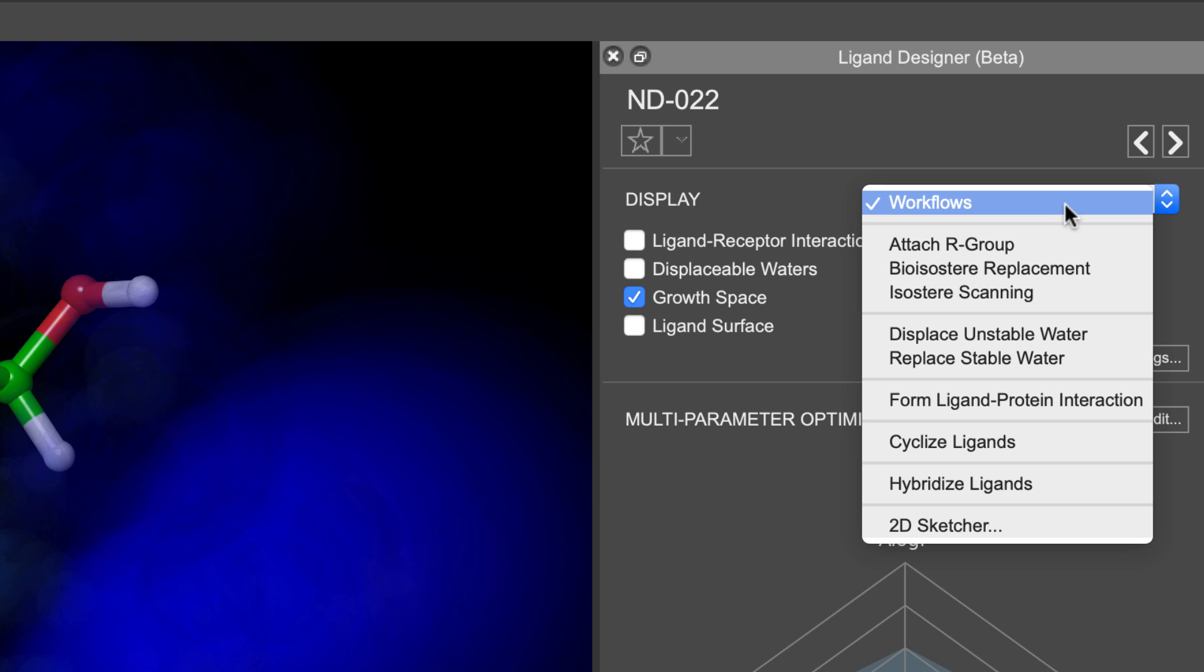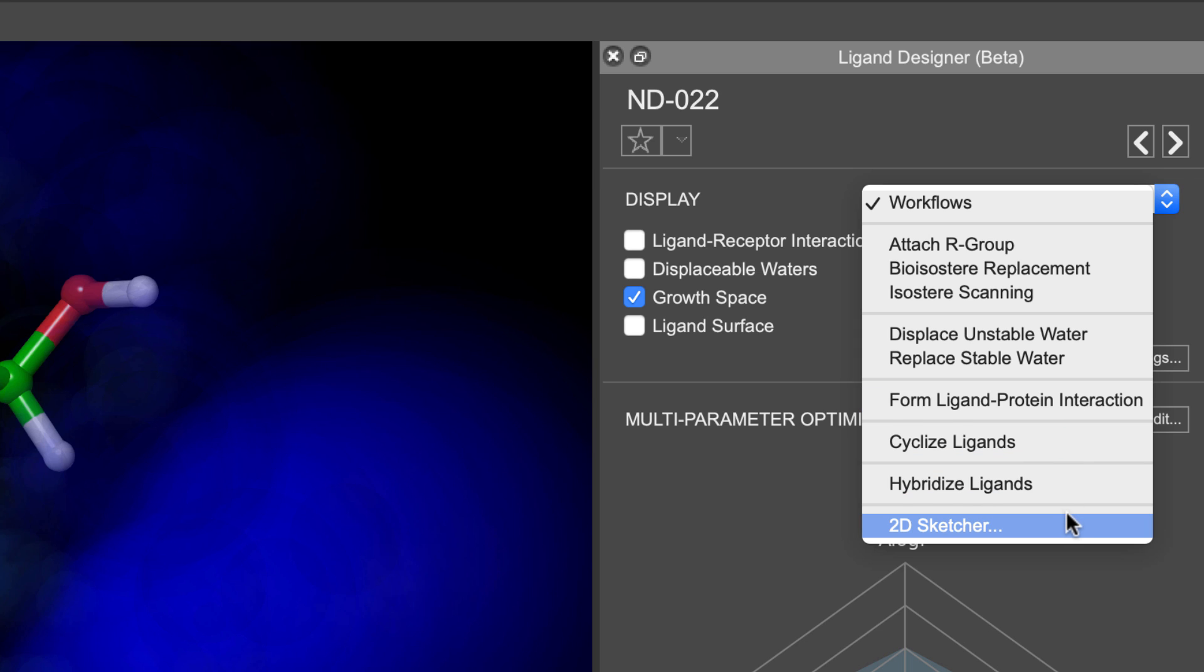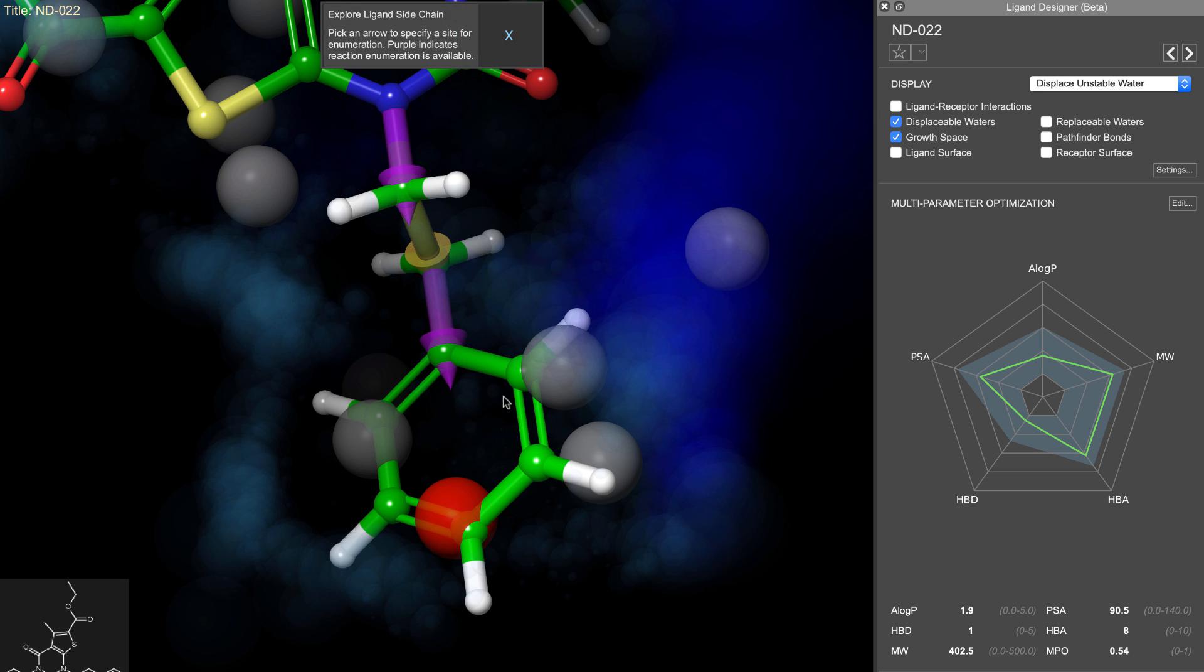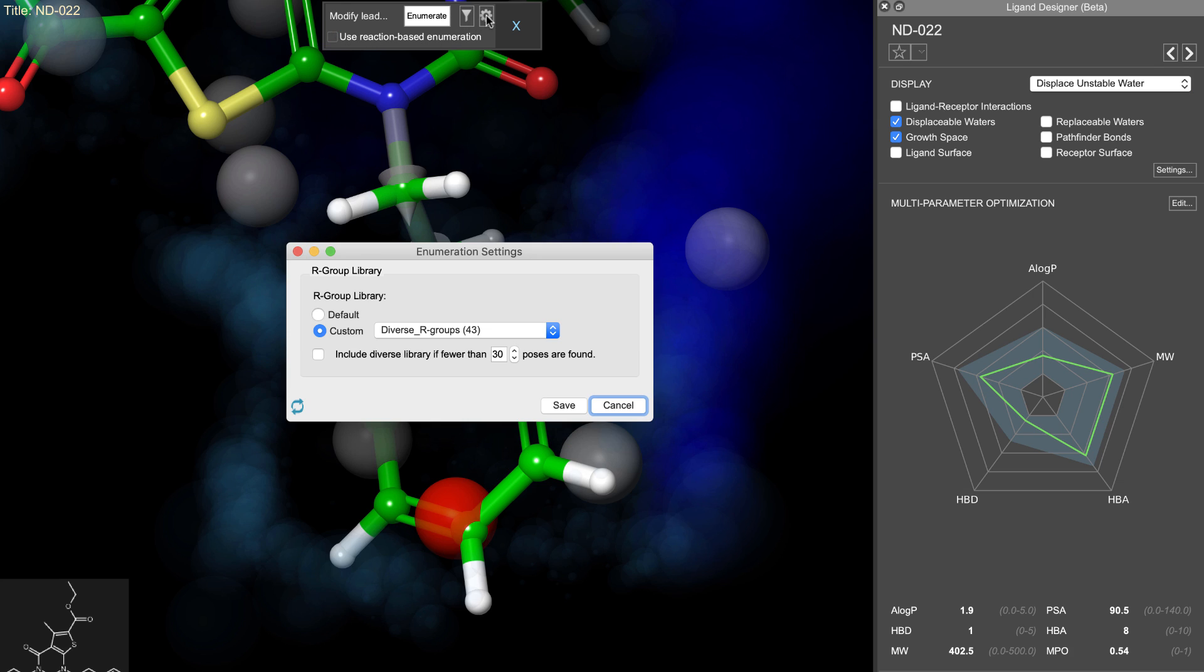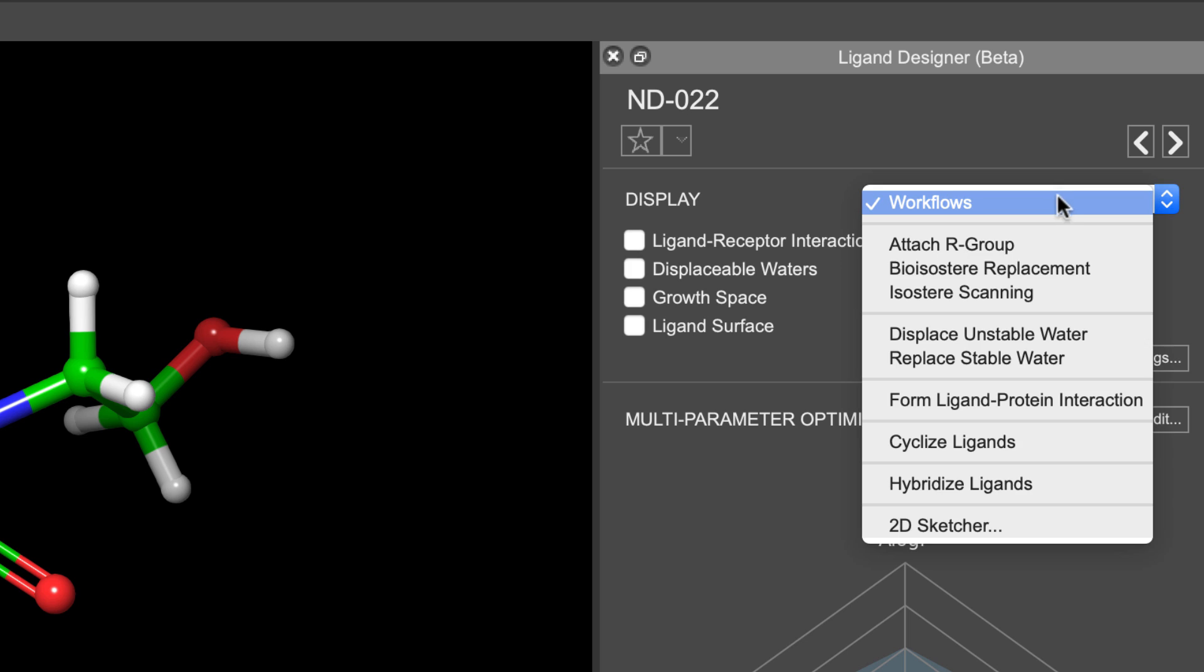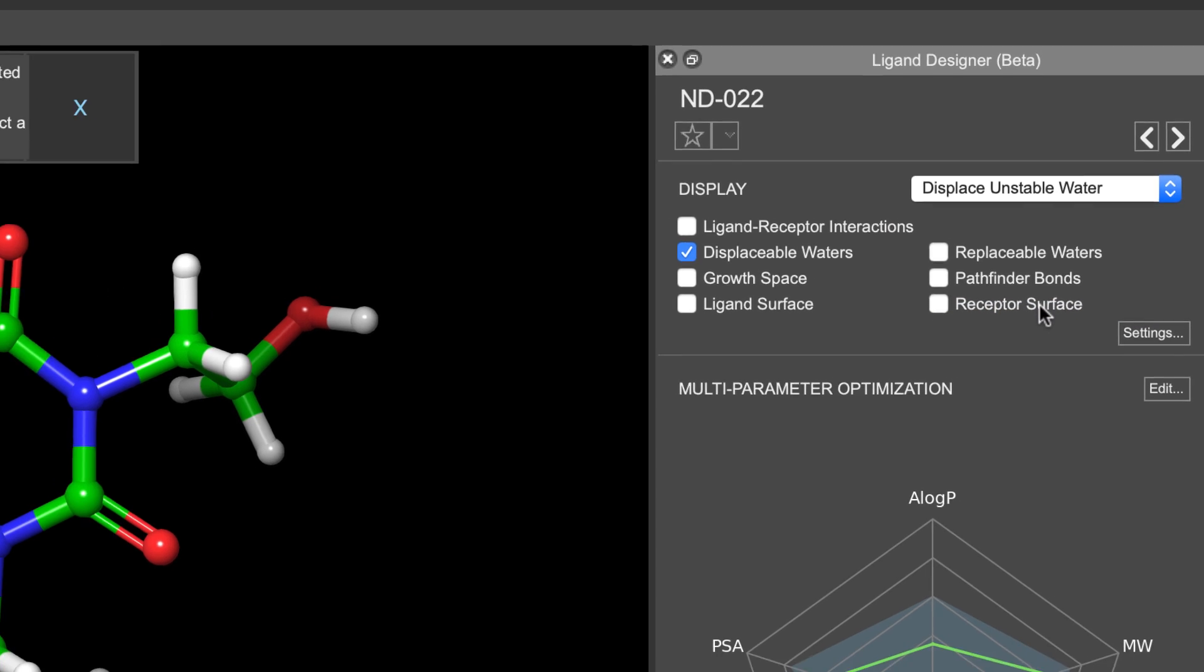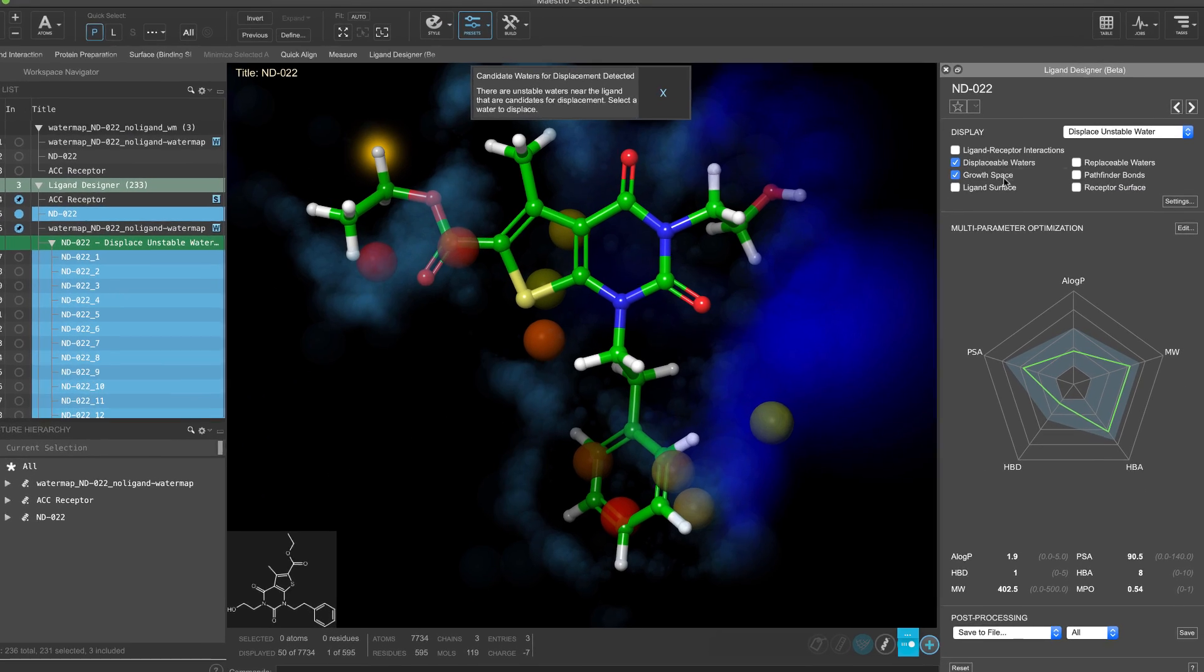The ligand designer employs several medicinal chemistry tactics and workflows, utilizing synthetically tractable enumerations or R group enumerations to automate modifications to the ligand. So, let's walk through several features of the ligand designer, starting with the visualization.